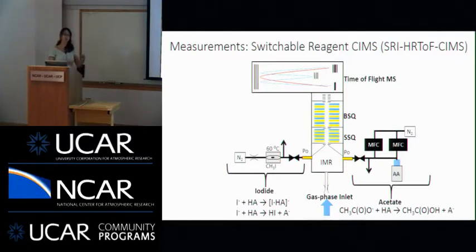We can also do a proton transfer reaction. So we can take the proton from our molecule of interest and move that proton over to I-. And now, since we've removed a proton from our molecule of interest, we have an anion. And we can do a similar set of reactions with acetate. So now that we have charged the molecules in the atmosphere with whatever chemistry we choose to use, those ions can now get sent through a series of quadrupoles. The quadrupoles are really there to direct the ions into our mass spectrometer. And then we use a time of flight mass spec to actually analyze the data.